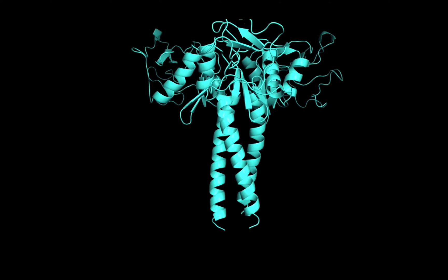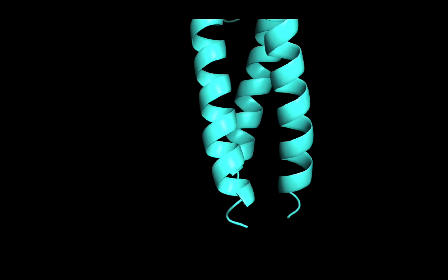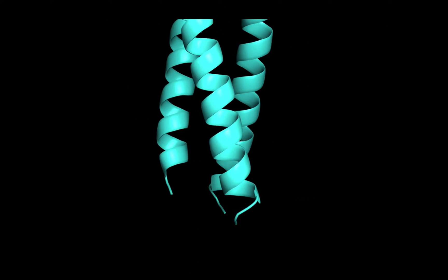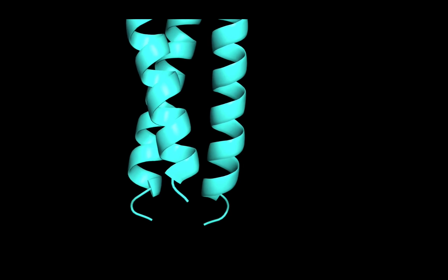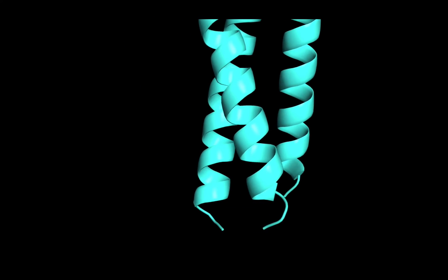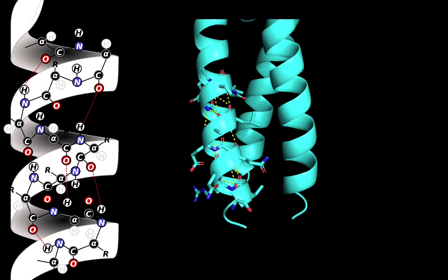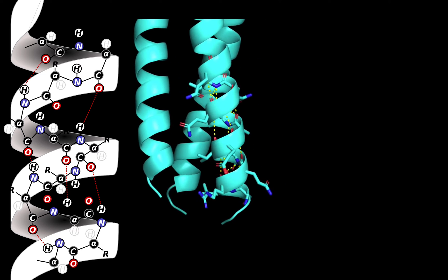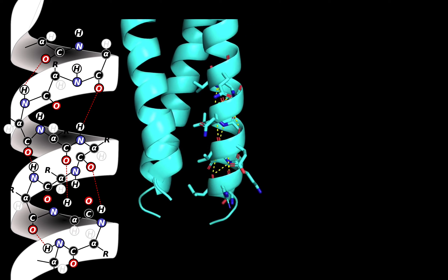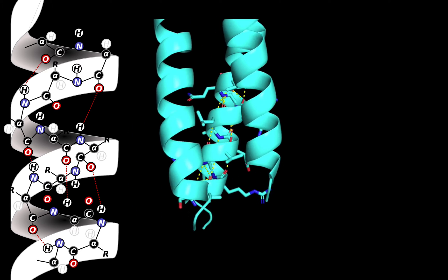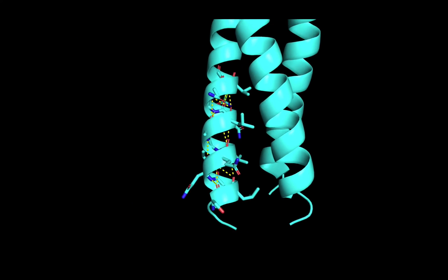Now let's take a look at the alpha helix. These twisting amino acid clusters are also stabilized by backbone hydrogen bonds. When we show the stick rendering and add in the yellow hydrogen bonds, we'll notice they line up differently. Each carbonyl group is bonded to an NH of another backbone atom three to four amino acids away.